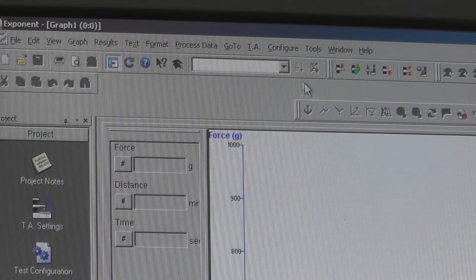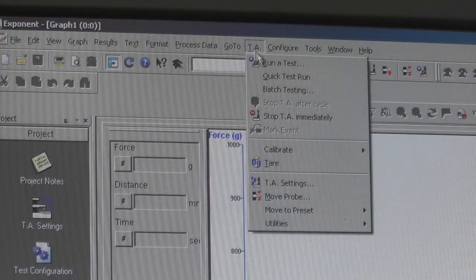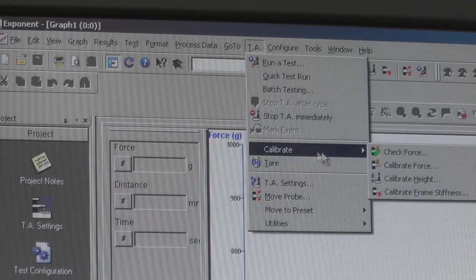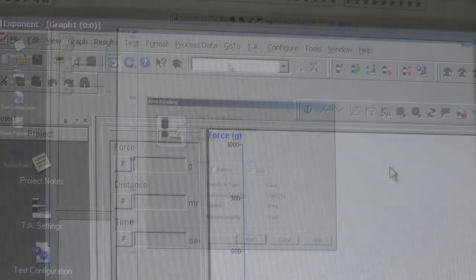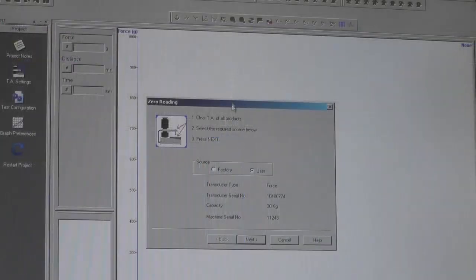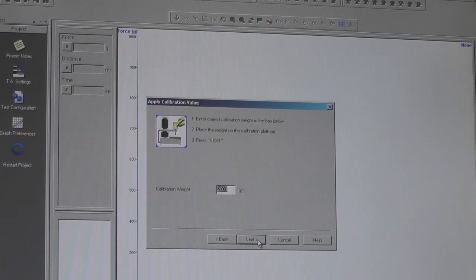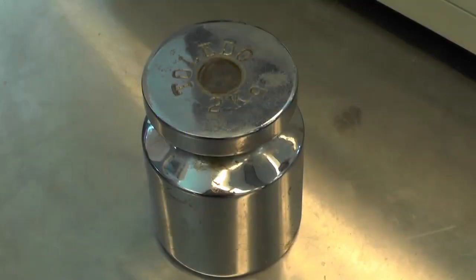First, go to the TA tab on the top panel. From the calibration menu, select Calibrate Force. Follow the instructions and click on Next.